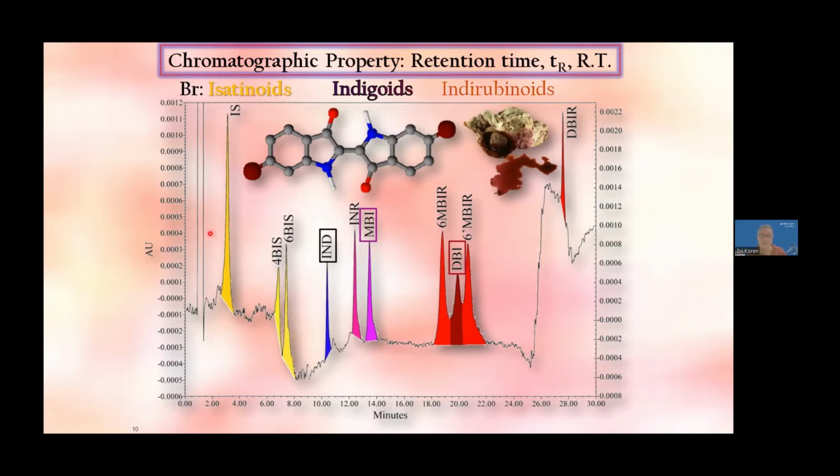And there is nothing like HPLC to give you about 10 different colorants, if not more, even the trace ones you can get by that. And it gives you a fingerprint. You'll know more about it as I talk about chemical fingerprinting, this particular pigment and the reason for it.